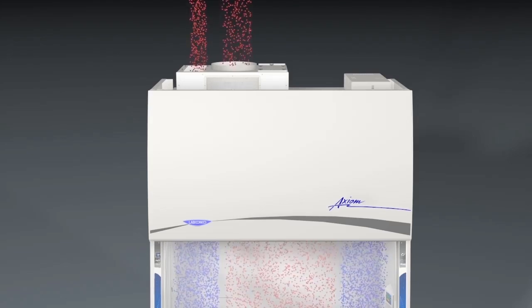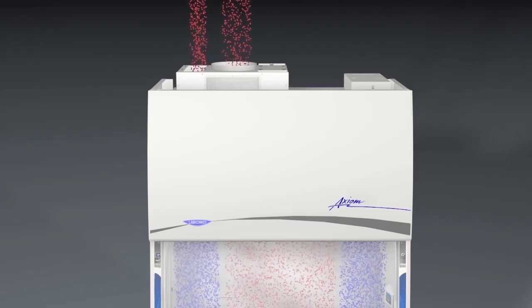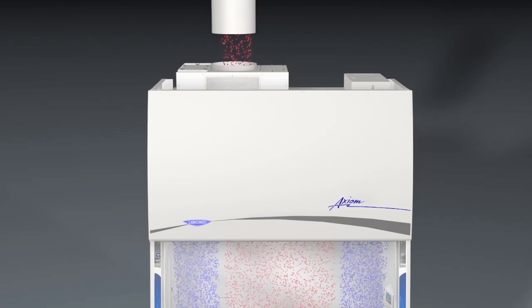However, if hazardous chemistry or odorous work is being performed in the cabinet, the cabinet should be installed in Type B mode.